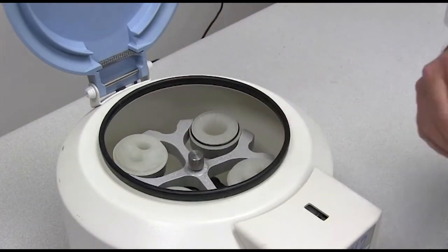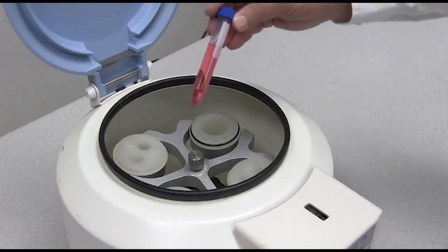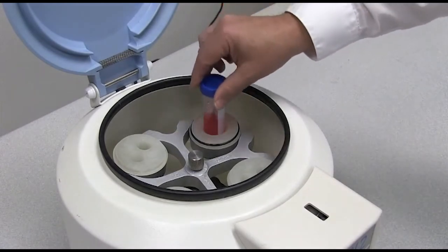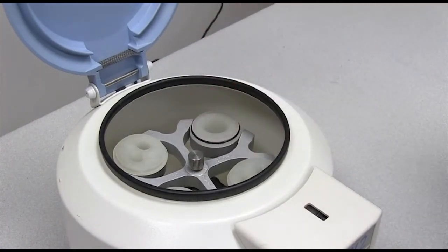two types of carriers: one for the 15 ml centrifuge tube and one that would hold the 50 ml centrifuge tubes.